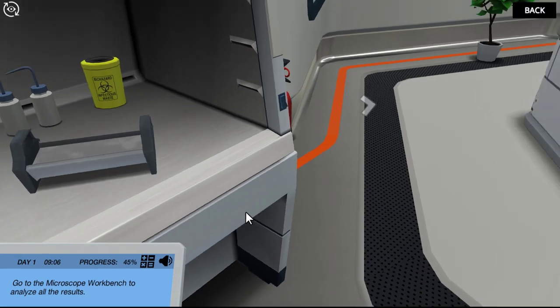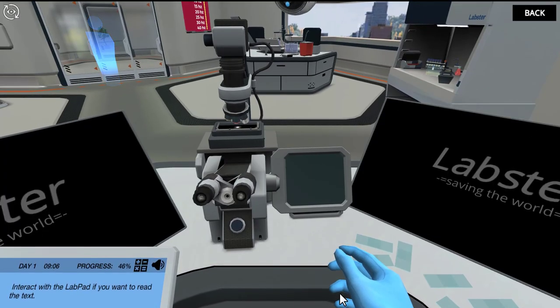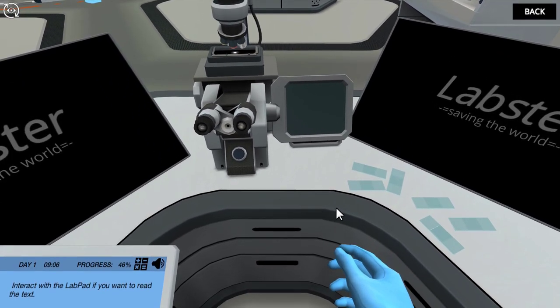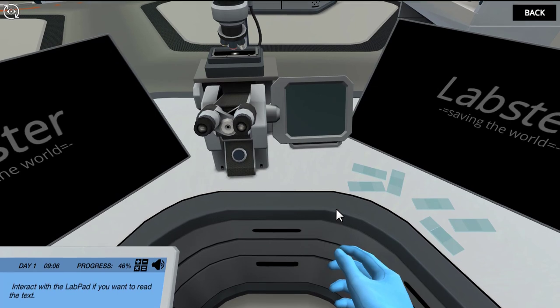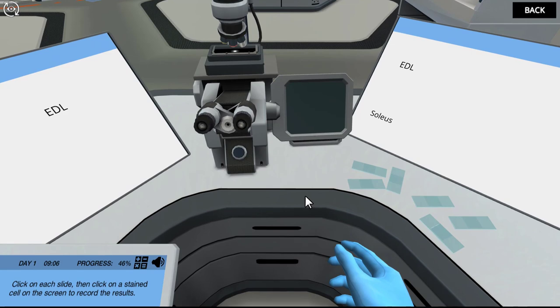Go to the microscope workbench to analyze all the results. Each of the six slides on the workbench contains a beautifully stained slice of either EDL or soleus muscle tissue. Take a look. Click on each slide, then click on a stained cell on the screen to record the results.